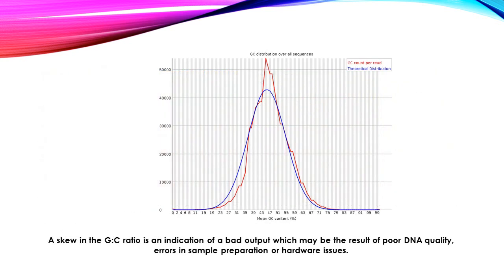Another aspect which provides an insight into quality is the GC ratio. So a skew in the GC ratio is an indication of a bad output. So this shows you the GC counts per read in red and the theoretical distribution along the blue bell-shaped curve. This can give an indication of DNA quality.